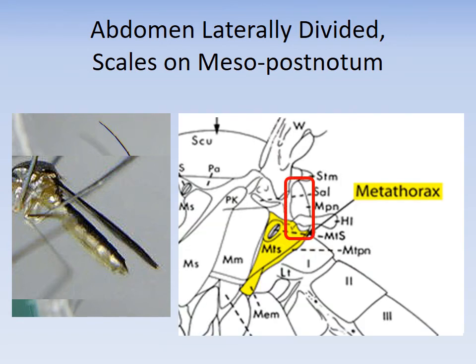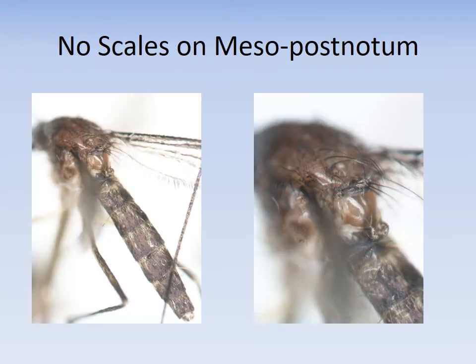And so we're looking at this region here on the diagram. We're looking here for the CD. Just to give you a better idea of what a Wyomyia smithii looks like, if you haven't already seen one, this is a picture of the specimen that I flipped over.